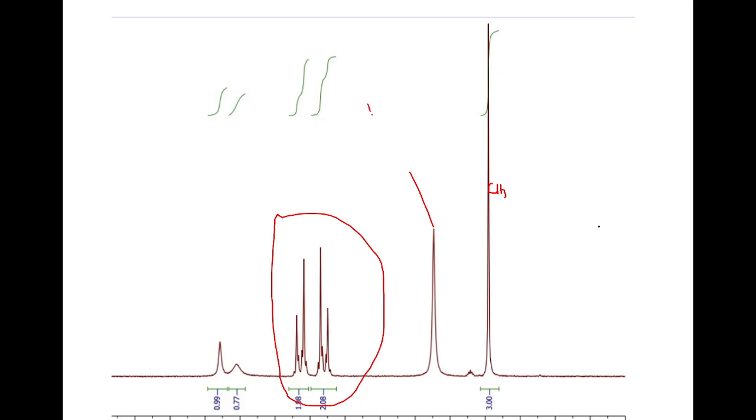Now this instrument that they used to do proton NMR for paracetamol was a strong one. Now it gives you OH here rather than here. This is the NH, and that looks like some impurity. This is the doublet, okay? The doublet for this one for the meta, this one for the ortho, and that's for the CH3. Did you see? That is the proton NMR spectrum of paracetamol. That's how we know this is paracetamol.